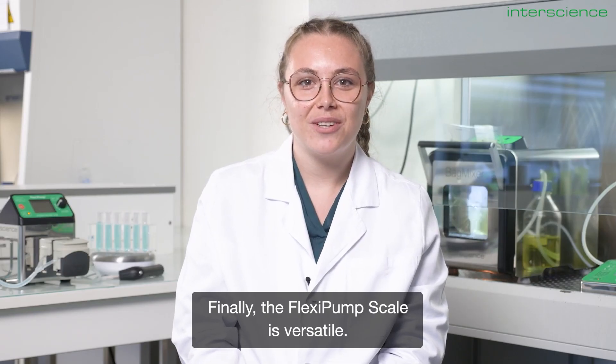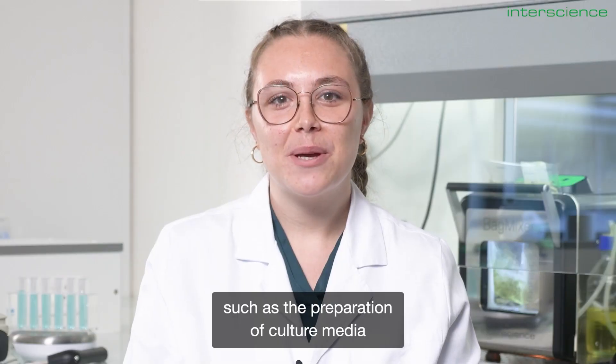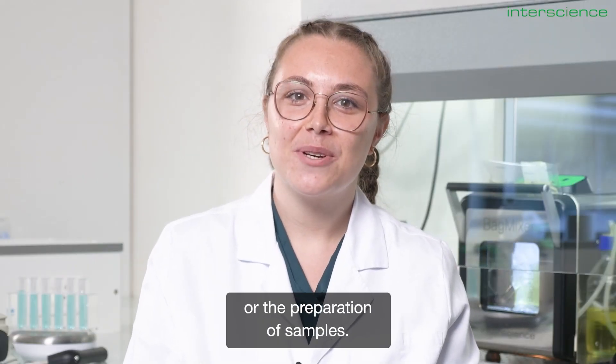Finally, the FlexiPump scale is versatile. I use it routinely in the laboratory for many different applications, such as the preparation of culture media or the preparation of samples.